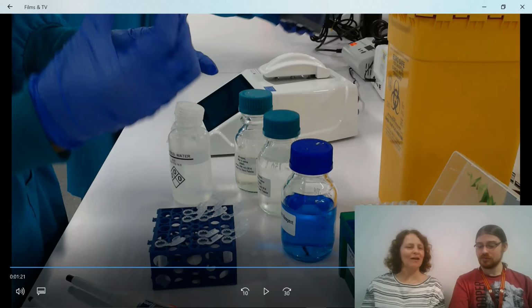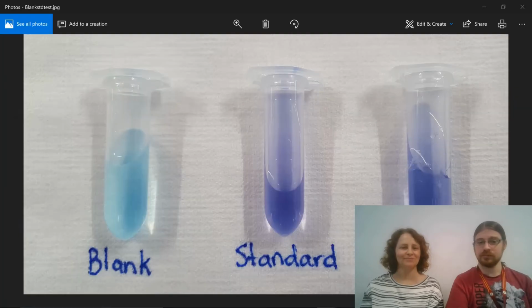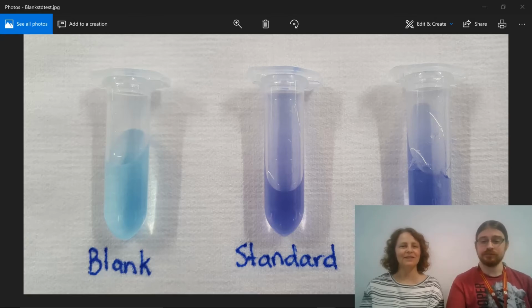So if we have a well mixed sample, what are our set of results going to look like? Here is a comparison of our blank, standard and test samples which have been prepared. As you can note, there is a colour difference, and this difference is what is being measured by the spectrophotometer. So these tubes are lying on their side, so that's why their volumes don't look the same.